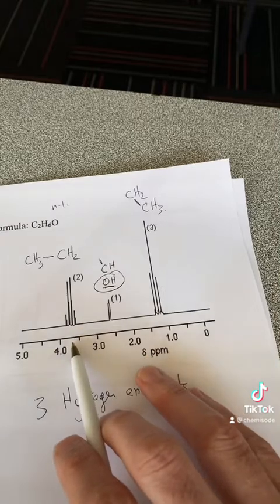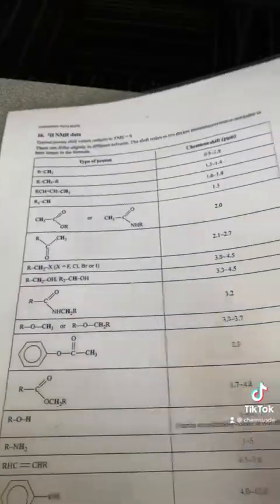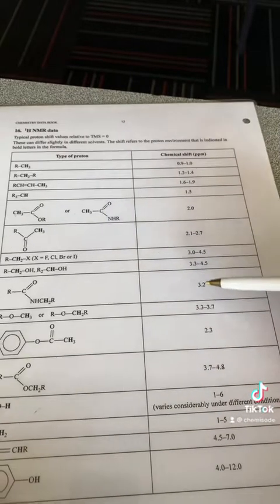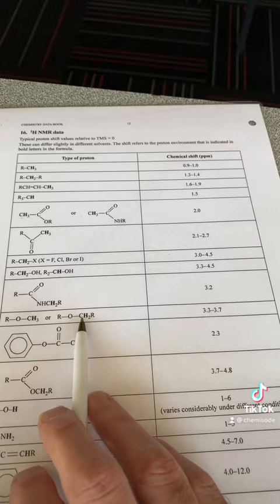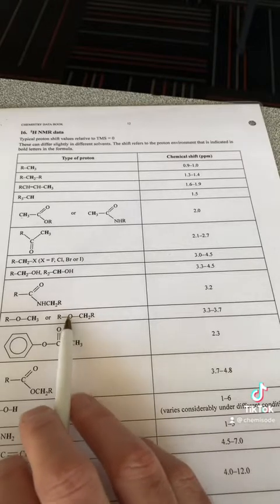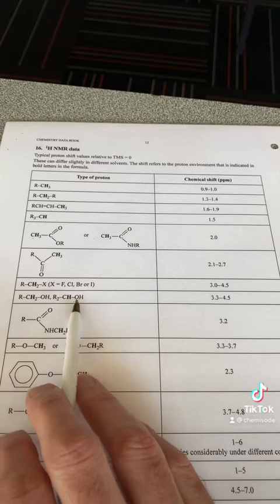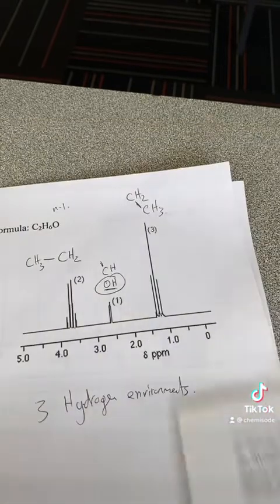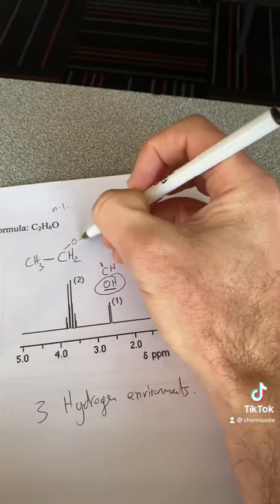This one up here, which is just above 3.5, I'll have a look at what information I have here about 3.5, and it sits here. It's either going to be a hydrogen bonded to something like an ether group here, but this one here, which is an OH, which I think it has as well, sits in there as well. So chances are this one here is also bonded to an O-H.